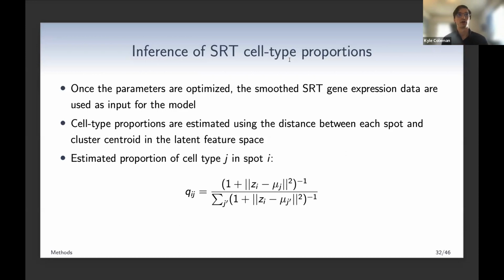Yeah, so it's a good question. You can definitely use more than one as well. If you normalize them properly, you can combine multiple single cell RNA sequencing data sets, and that'll actually optimize both parts of the network better, both the unsupervised dimension reduction and the actual clustering part. If you have to choose one though, you should choose it based on whatever cell types you're looking to identify. A lot of annotated single cell RNA sequencing data sets will have different cell type labels. Some will be more specific than others. And so you should choose whichever one has cell types that you're most interested in identifying in your spatial data set. Yeah, I see. That makes sense.